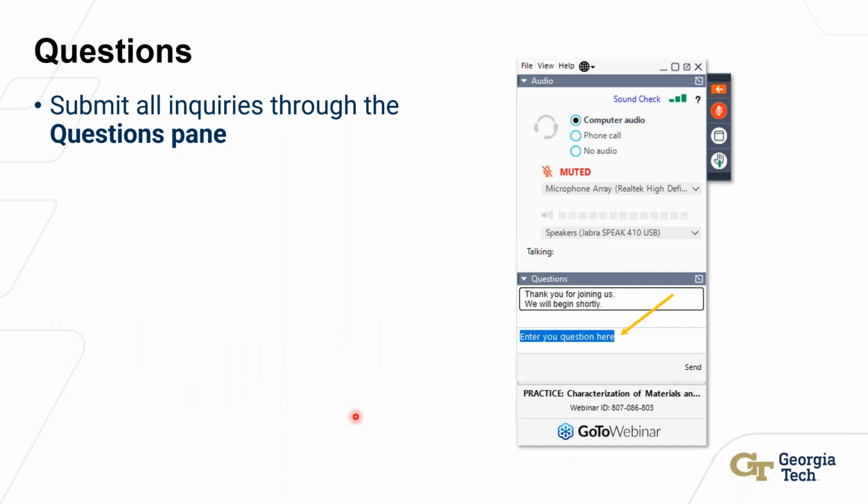So your limitation in space is probably going to be dictated more by your sample than by the actual collection. Again, each one of those maps took 5 minutes. In the EBSD community, we're used to running scans for hours often. So within hours, you're going to be limited much more by your sample than by scanning speeds or anything like that. So you can look at microns of material in a typical sample.